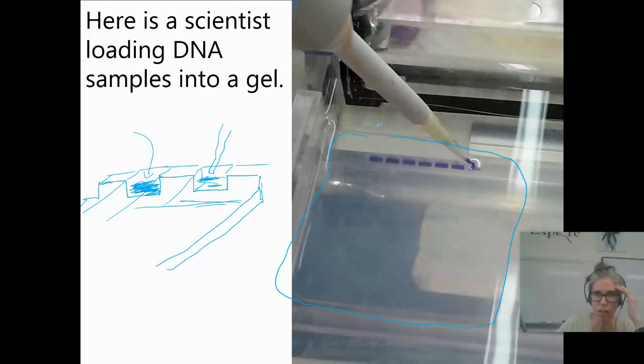So you load your samples into the gel. Maybe this is the DNA from a crime scene or something, and this is DNA from different suspects. Or what we're doing in lab is going to be viral DNA that we cut with different restriction enzymes.